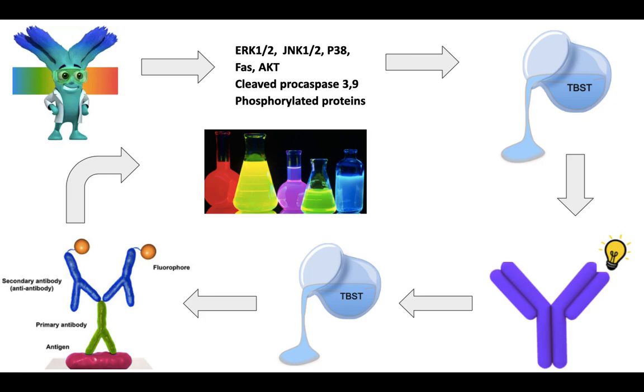Overall, in identifying this, antibodies are extremely useful in identifying the presence of certain proteins. By identifying the proteins, such as the apoptotic ones, we can identify the effect of azelaic acid in expressing these and therefore in inducing apoptosis.